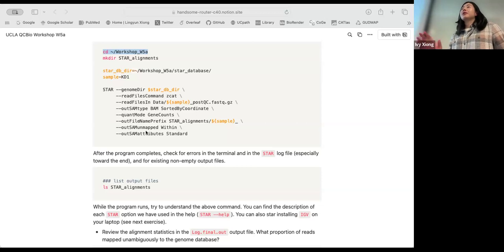RAM is more for this specific instance of computation, how much short-term memory I'm using. And we are requesting 4 GB. That's decent for most moderate intensity computations. But for aligning multiple genomes or multiple samples, you want maybe 4 GB for each job and then scale it up.